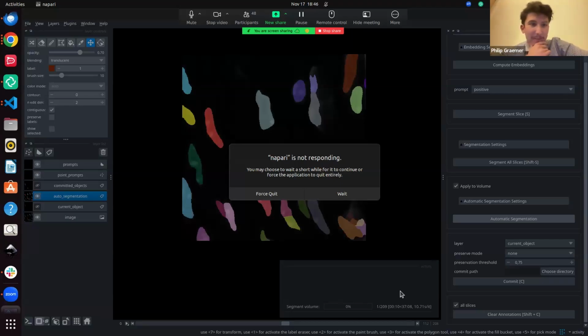Do you have any tips for the fine-tuning? Or, I mean, it's a bit of a broad question. Also, have you tried just doing lower rank adaptation versus a bigger fine-tune? Any insights on that?